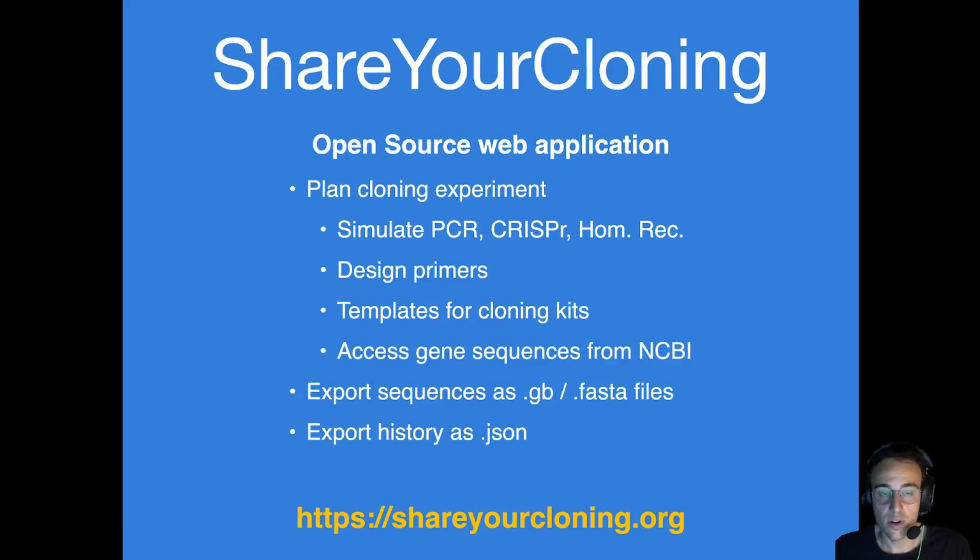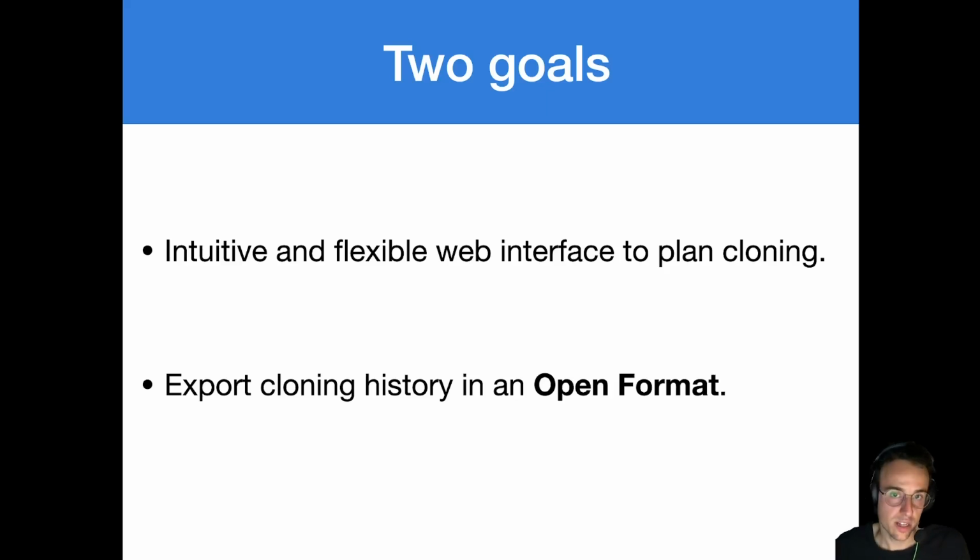Next, I'm going to give a brief introduction about the project, but you can skip it and go directly to the demo. The project has two goals. The first is to provide you with an intuitive and flexible web interface to plan your cloning, but also to allow you to export the cloning history in an open format.